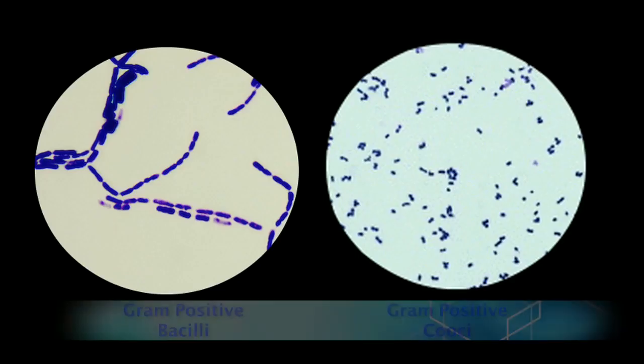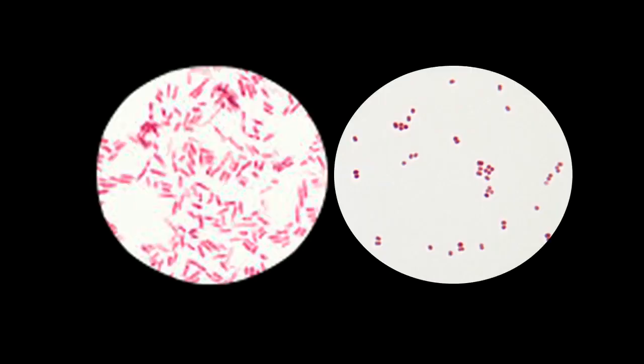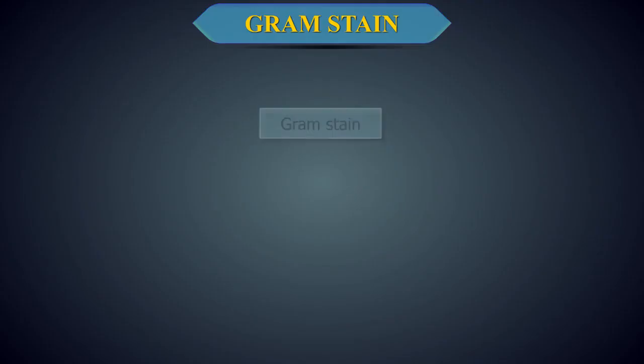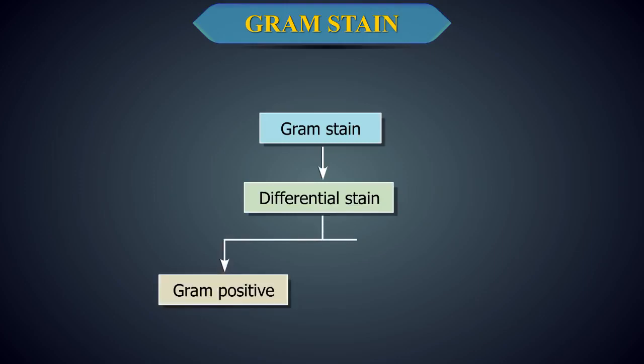Bacteria which retain the primary stain are stained purple and are called gram-positive bacteria. Bacteria which retain the counterstain take up the red color and are called gram-negative. Gram stain can therefore be called a differential stain because it differentiates between gram-positive and gram-negative bacteria.